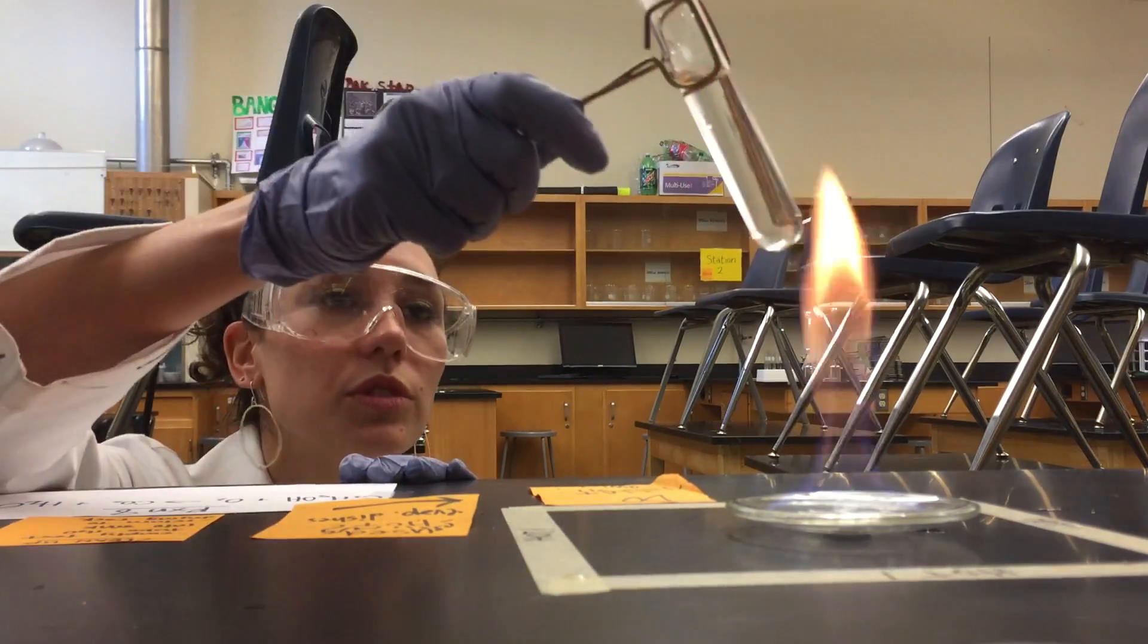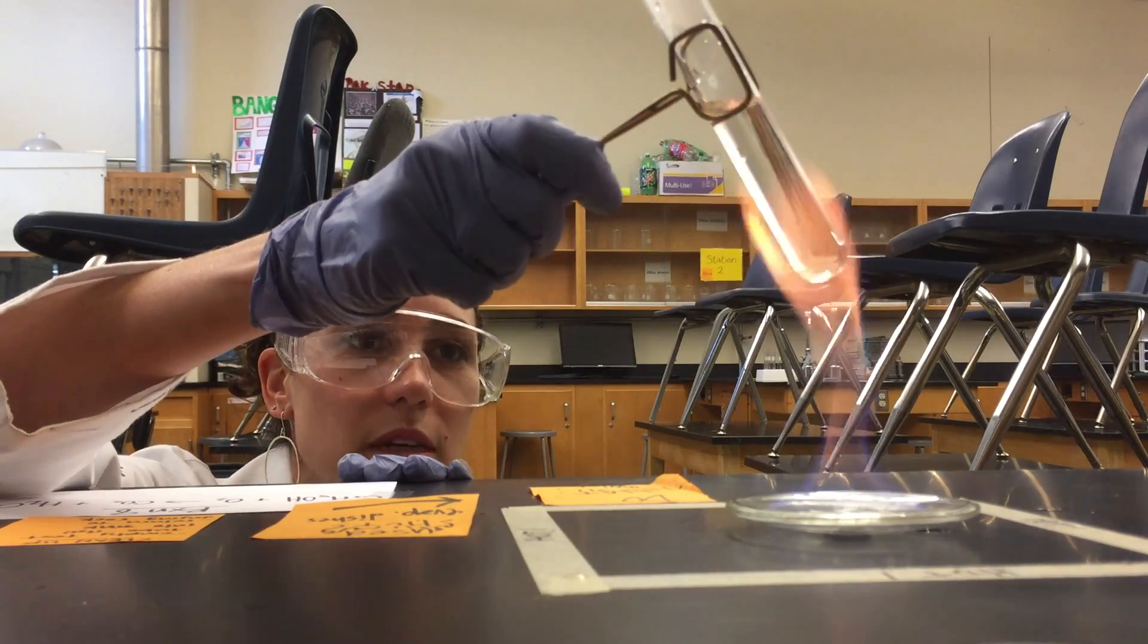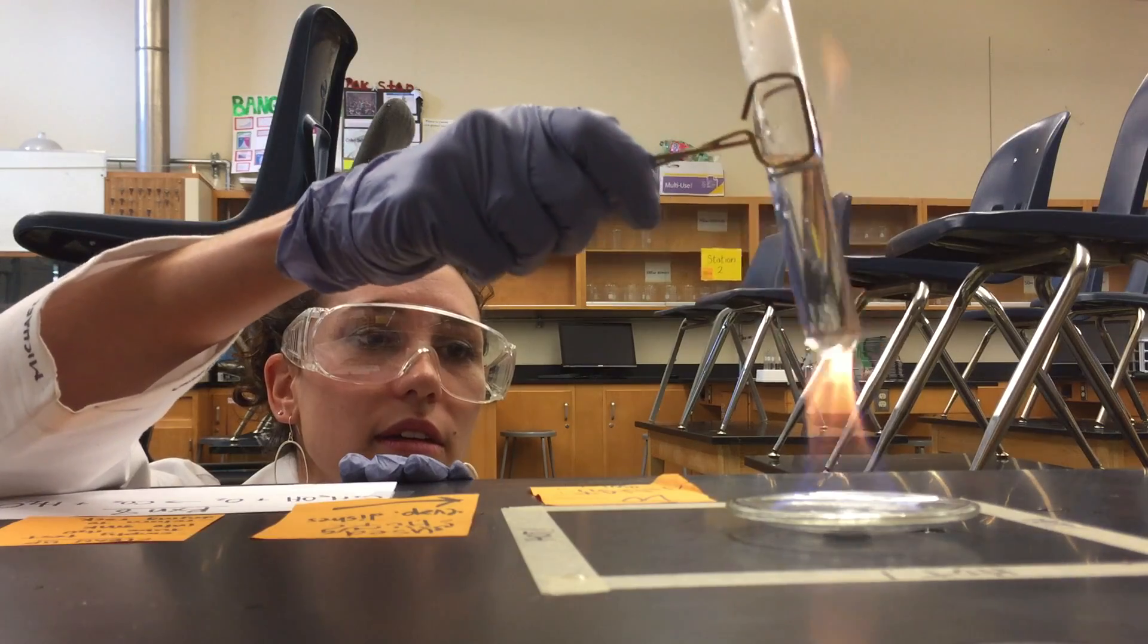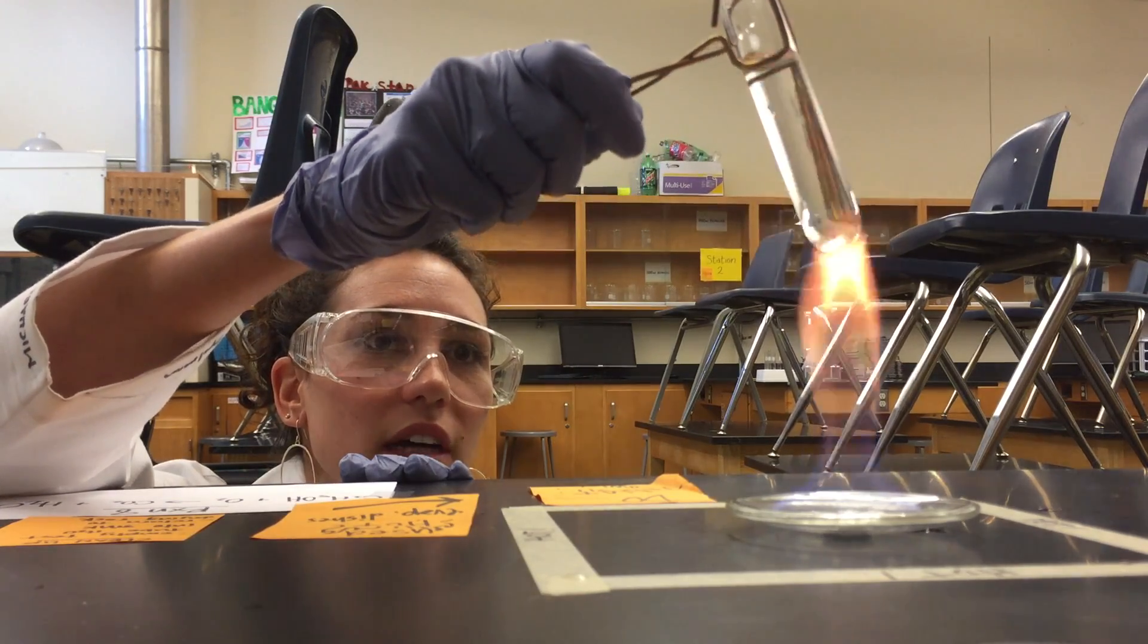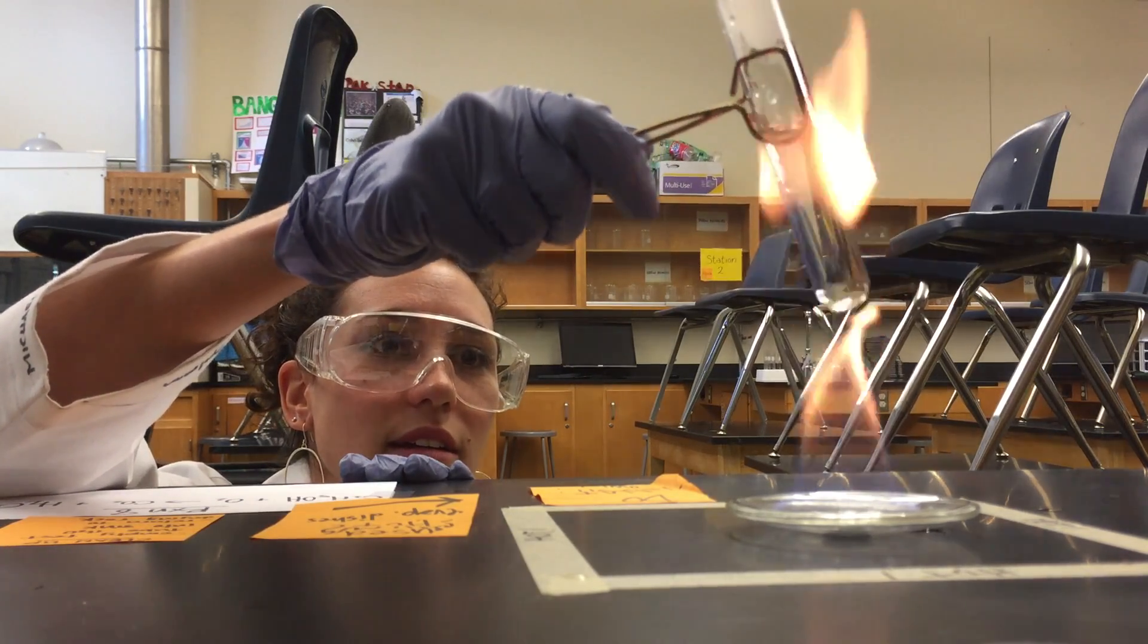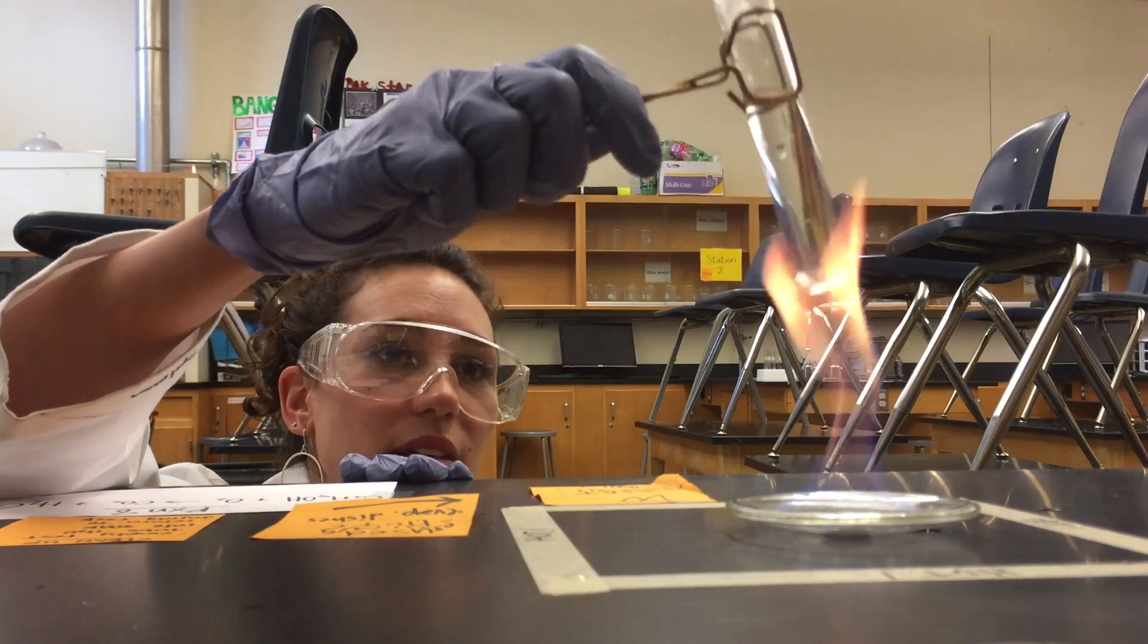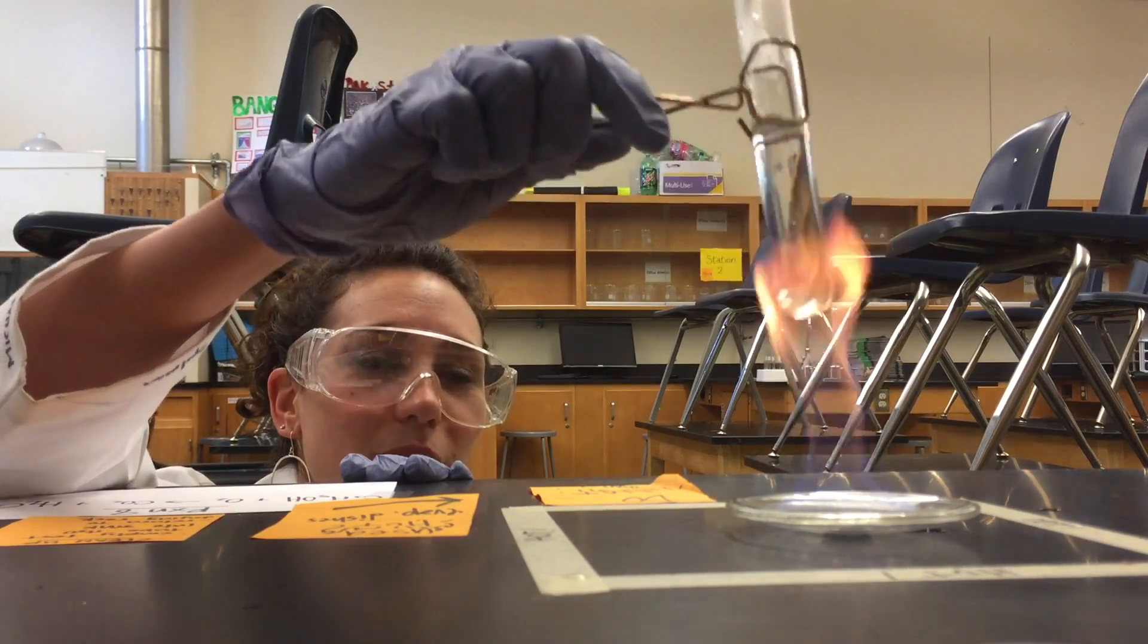So when I hold this cool test tube over it, we should be able to see water condense on the outside of this test tube. Now it's starting to get a little foggy—we can definitely see water condensing on the outside. Beautiful.